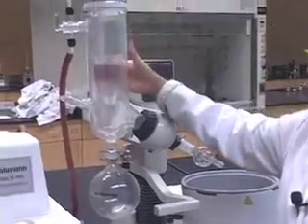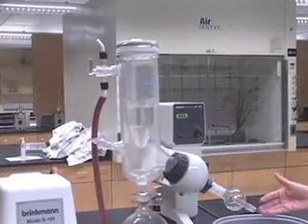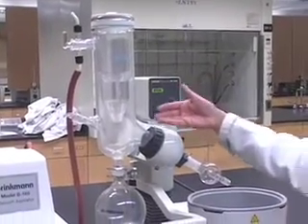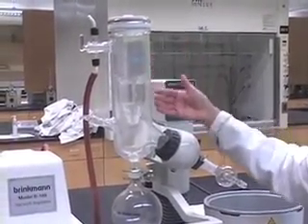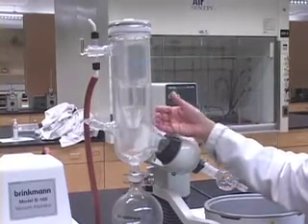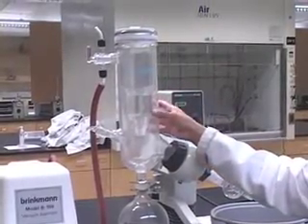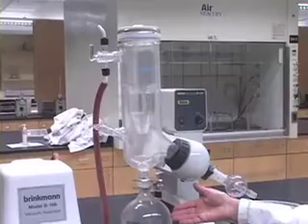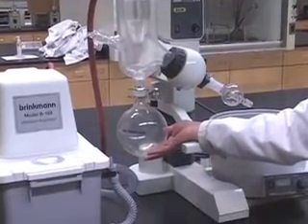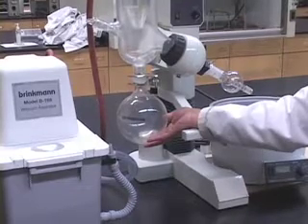This portion here is the condenser. When the solvent evaporates off from the system and reaches this condenser part, which will be kept cooled, the solvent will condense on the condenser portion and then fall back into this chamber in which you can collect the solvent that you are evaporating off.